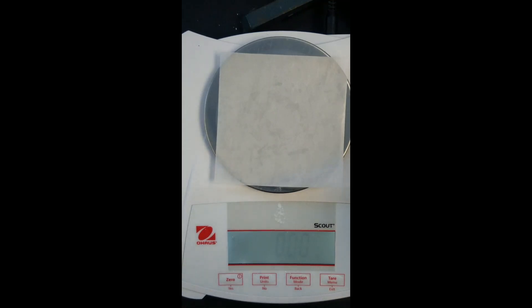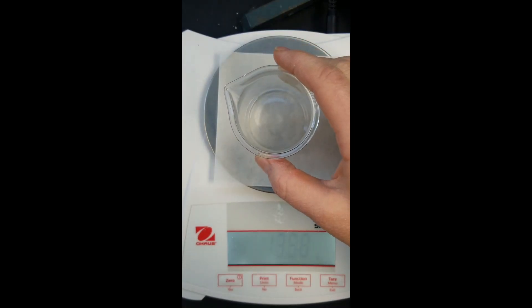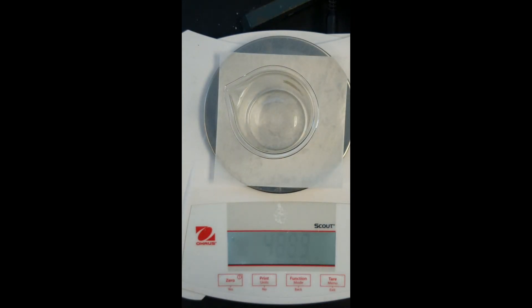We're going to determine the percent fat in potato chips. So we're going to start by taking a 100 milliliter beaker and recording its mass. Make sure you write down the mass of this 100 milliliter beaker.